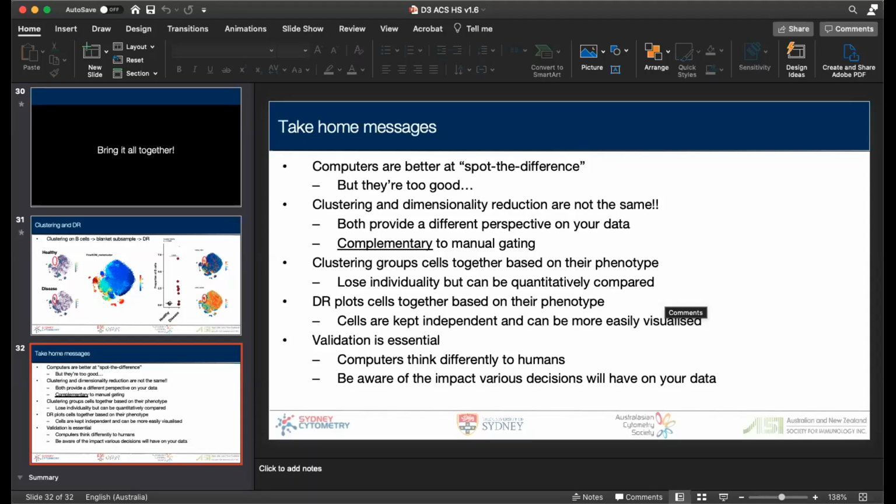So as you addressed, one thing is if we are not clustering with enough granularity, then yes, we might be collecting groups of cells together which really should be pulled apart. If that happens, it doesn't actually have to be a huge issue. What that can reveal is that this singular group of cells that we're trying to treat as one group maybe isn't. That's an informative thing to see, because the visualization takes away our bias. I mean, it introduces different kinds of bias, but it takes away our assumption that this is one group.